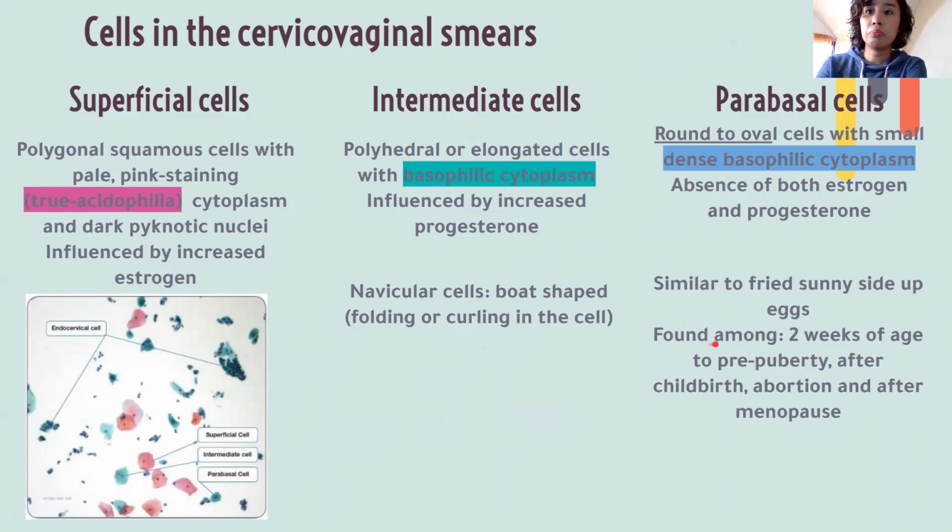Similar to sunny side up eggs. Found in pre-puberty, menopausal, abortion, and after childbirth.